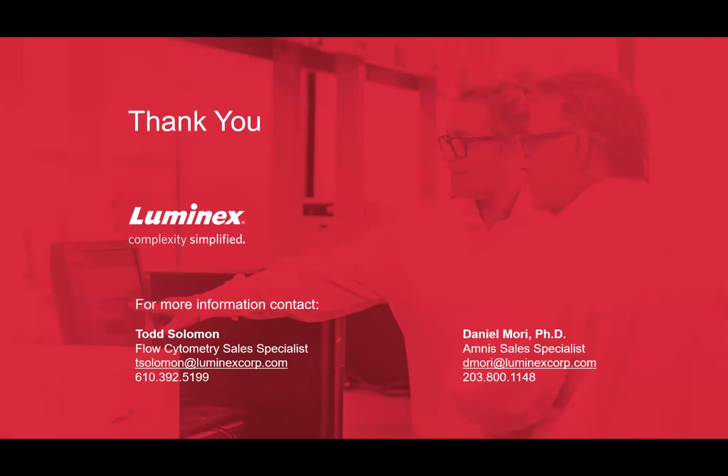So I think the biggest hurdle that we see from our end is the sample concentration. The recommended sample concentration on the ImageStream side is 20 million cells per mil, or 1 million cells in 50 microliters. So step 1 is just making sure your sample's concentrated enough. And then it's on the panel development side, because our filter stack is a little bit wider than traditional flow. You also have to make sure you're properly titrating your antibodies, because we are using a camera-based system. The compensation's slightly different, and you just want to make sure that, say, if you're using FITC and PE, because we control the laser powers and not the detector gains, that your PE isn't so bright that you need to turn down the power on your 488 laser to the point where you don't see your FITC fluorescence. So titration's also going to play a big role in that.